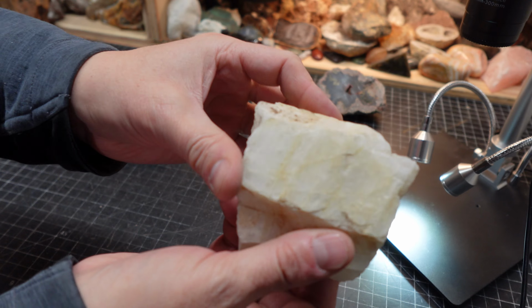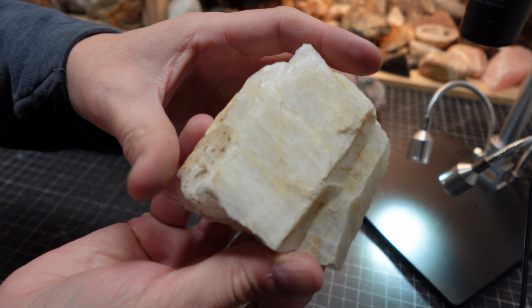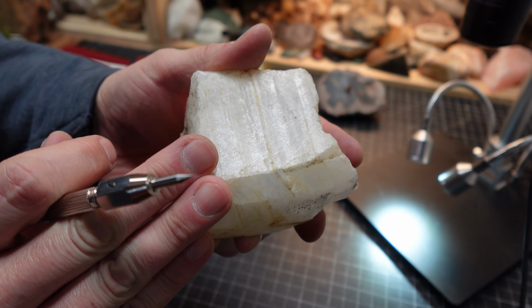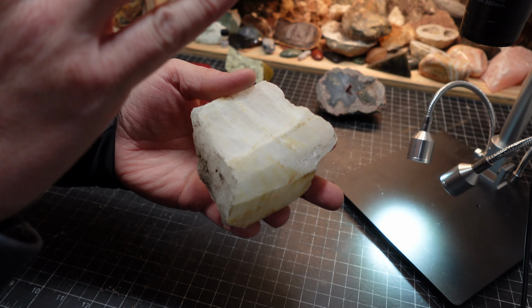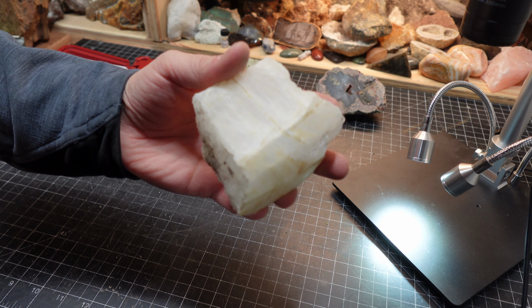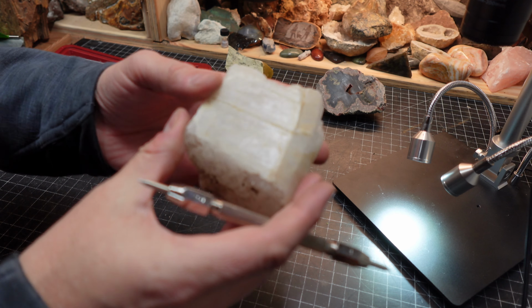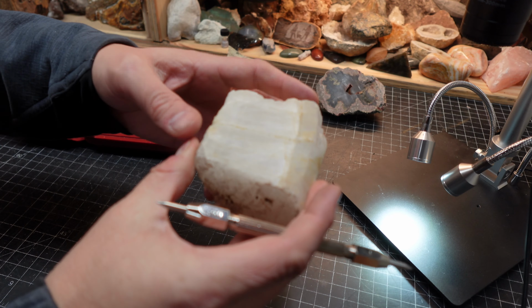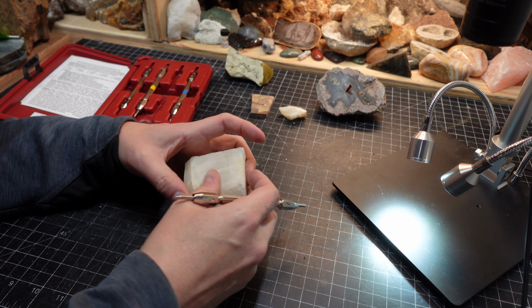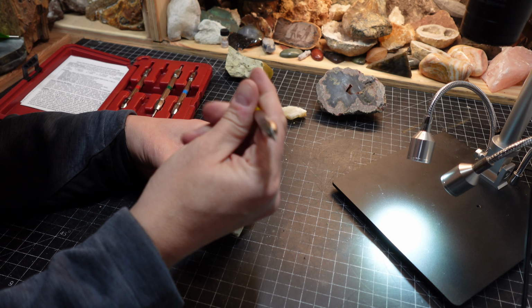This guy right here. Same thing. This is a lot harder. Now this is more a natural cleavage face on this, which is tough because when we put it under the microscope, we don't have that nice, beautiful flat surface. And when it comes to doing this in the field, if you choose to do it in the field, you're gonna run into this problem as well. But let's pick a spot here. Oh, let's start with a 5.